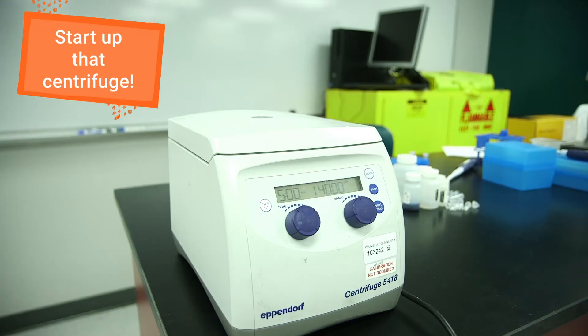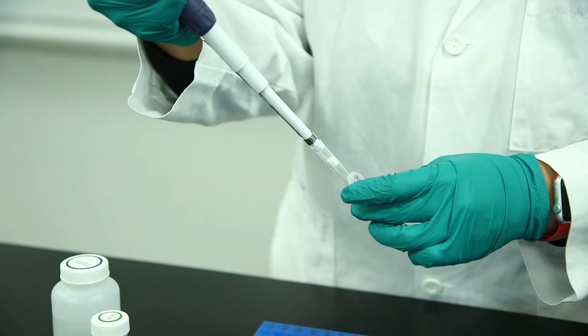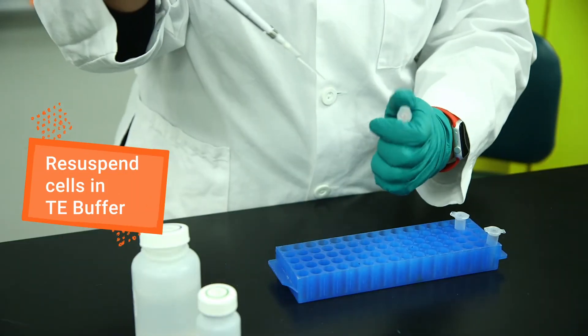First, centrifuge the culture to pellet the cells. Remove the supernatant and re-suspend the cells in TE buffer.